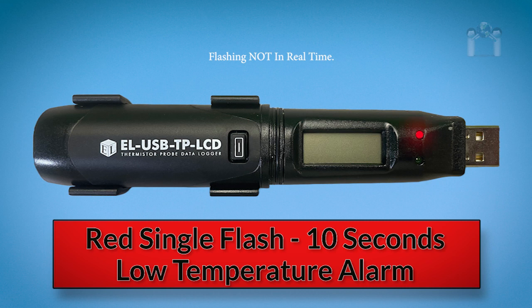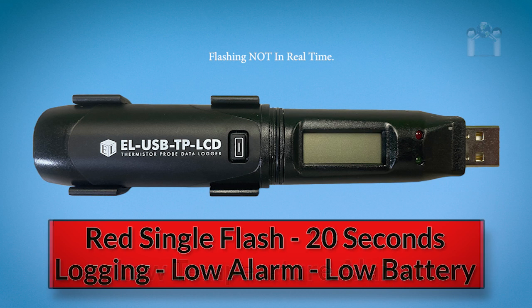A red single flash every 10 seconds means the data logger is currently logging but there is a low temperature alarm. A red single flash every 20 seconds means the data logger is currently logging but there is a low alarm and the battery is starting to run low.